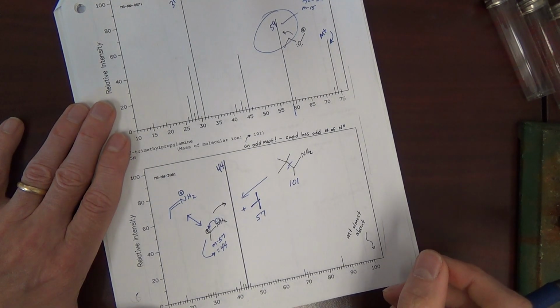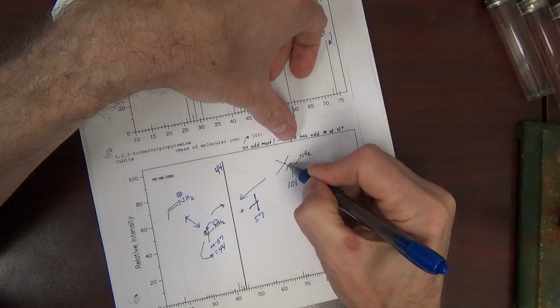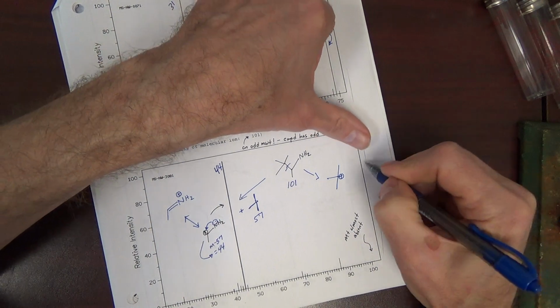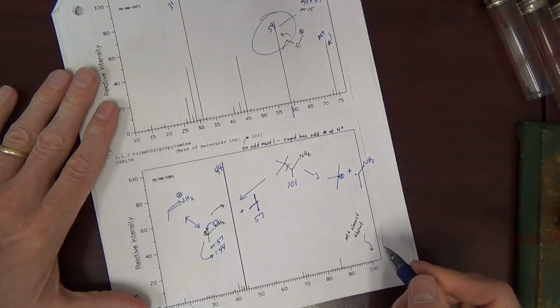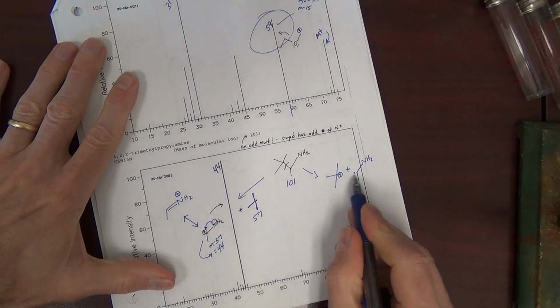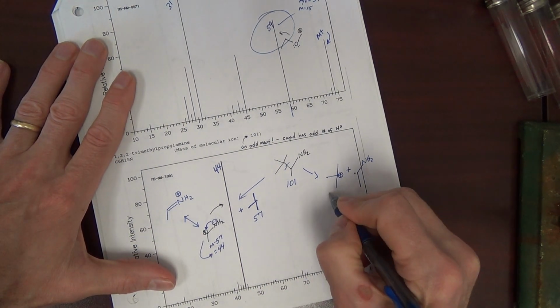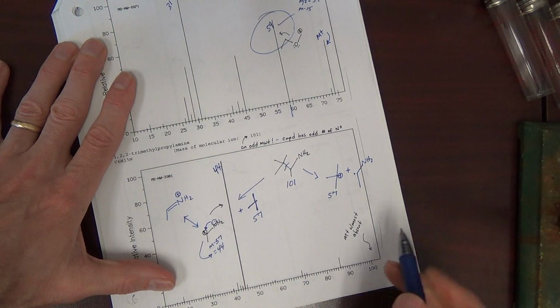Could we have predicted another cleavage here? What if this had cleaved in the same spot, but mechanistically the cation was left on the other carbon? And we have gotten that plus this radical. Again, we're not looking at any mechanisms. We're just saying a radical cation can cleave to make one radical and one cation. Then we have the charge and the radical on the two atoms that were just separated. But we could do it this way. This would be 57, same as that. The presence of an electron here doesn't change the nominal mass, and this would not be observed.